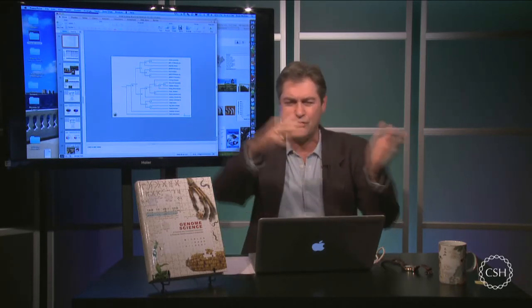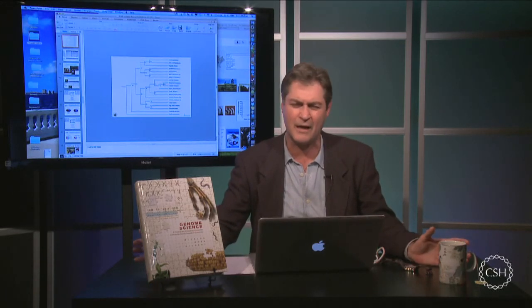Now, if they're barcodes for two entirely different regions, you're going to have a mess, because you're going to have superimposed trace files. But yes, in DNA barcoding, it's rare that you can use exactly one forward primer and exactly one reverse primer and amplify a range of species. Typically, there is actually a mixture of primers there anyway. Did that answer your question?